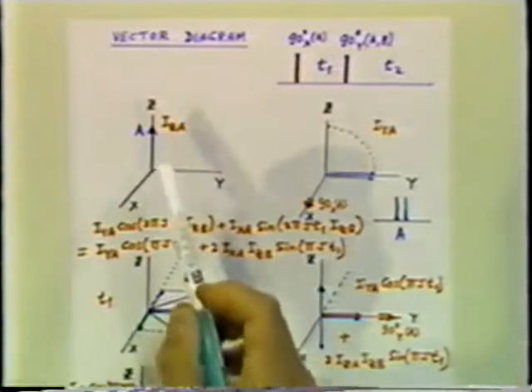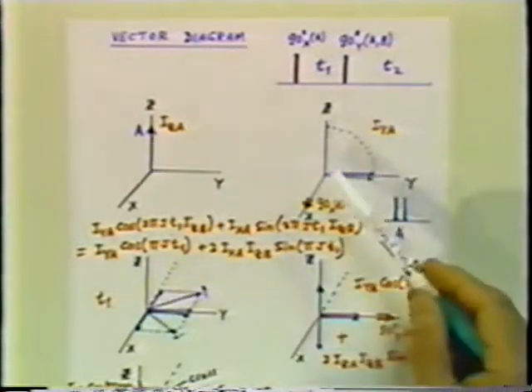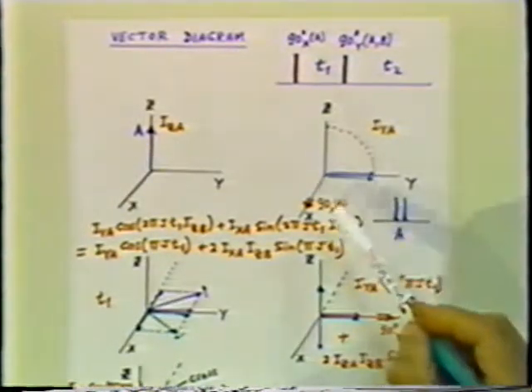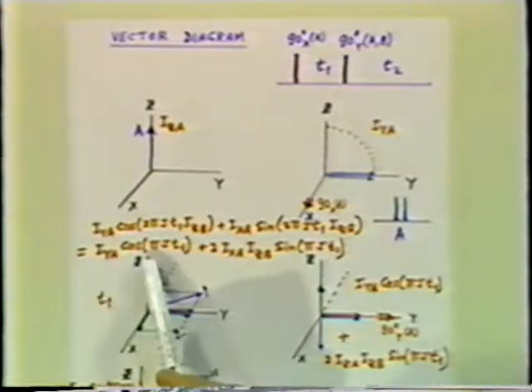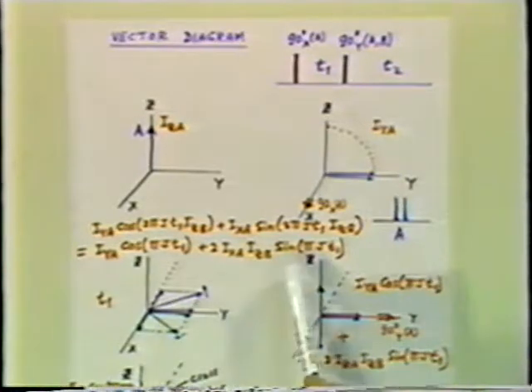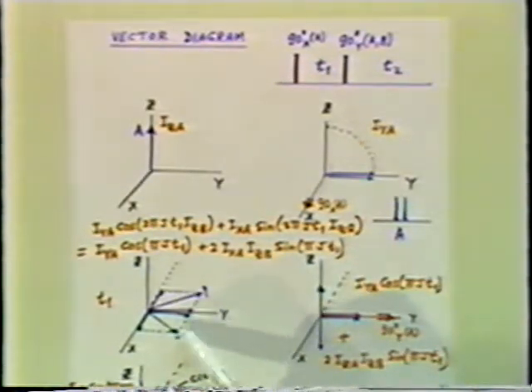We had a Z magnetization of spin A. We applied a 90-degree pulse along the x-axis. We got an IYA. The IYA precessing under J gives me IYA cos πJt1 plus 2 IXA IZB sin πJt1. This we have to build in at this point.